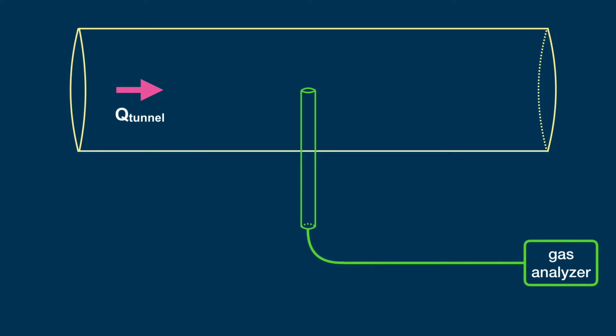If your laboratory is located in a dry climate with low relative humidity, simply increase the flow rate through the duct to dilute the humid cookstove emissions with dry room air. This strategy is the easiest and simplest to implement and ensures that the gas and particle samples will not condense at room temperature.